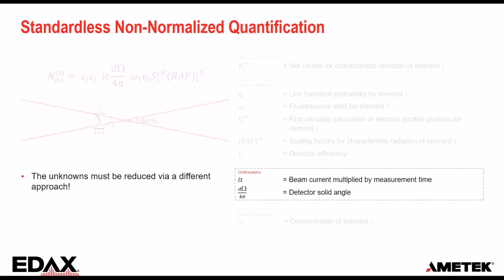So here we already struggle to be precise with those. And the decisive step we take here is that we're not interested in the value of the beam current or the time or the detector solid angle by itself, but we just put them all together. That's the first step. We call it parameter G, probably. We can call it whatever we want. Here we always talk about the physical parameters of the setup. So in the following section, I always refer to them as the physical parameters or the reference. So now we call that G, okay?